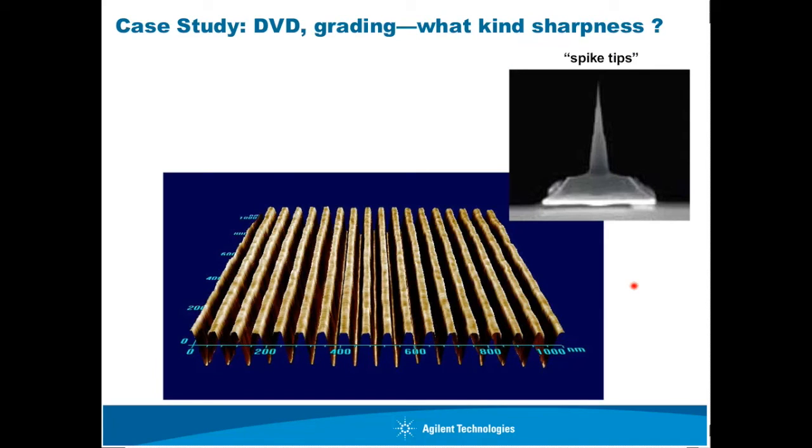Now, what I suggest: these attractions, I believe they're static charge attractions, some sort of electrical attractions. I did not try it, but I think that will work. You can image these gratings by immersing them in water and imaging in water, because in liquid those kinds of attractive forces disappear, and then you can use AC mode with a sharp tip.